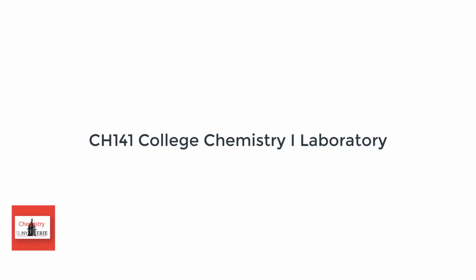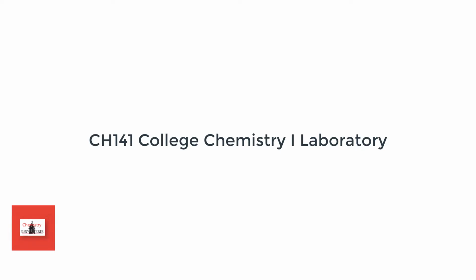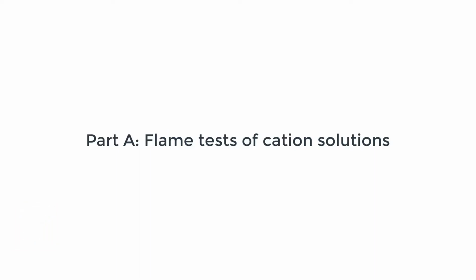Welcome to CH141, College Chemistry Laboratory 1, Families of Elements and the Periodic Table. Part A, Flame Tests of Cation Solutions. This part may be performed as an instructor demonstration.